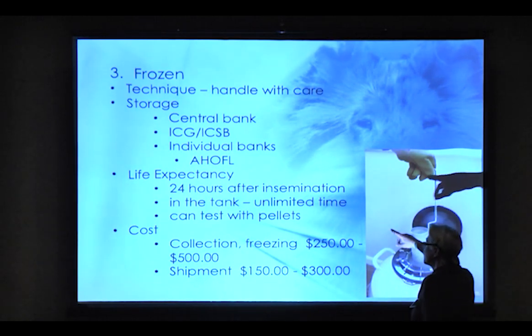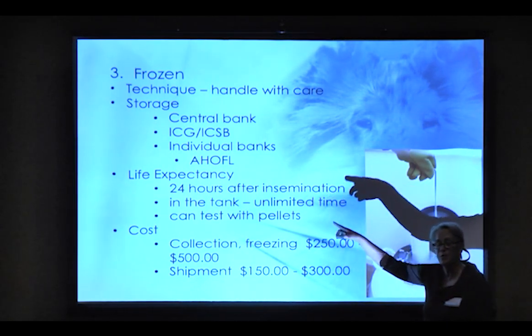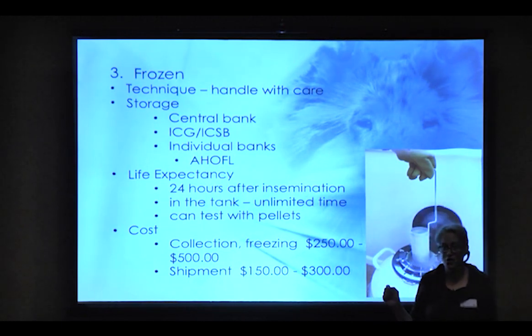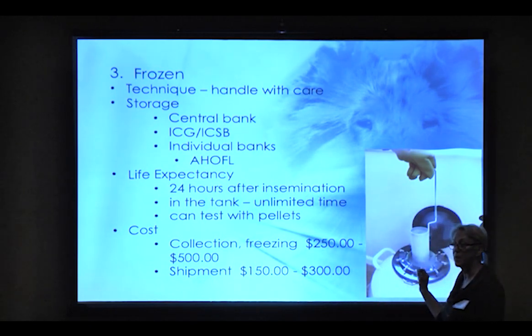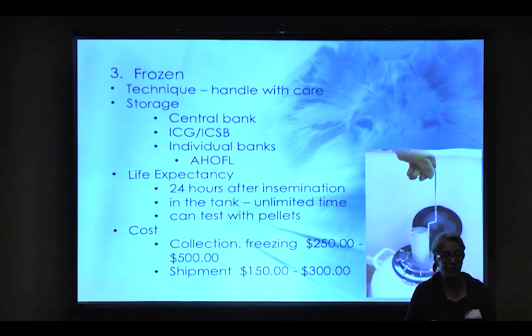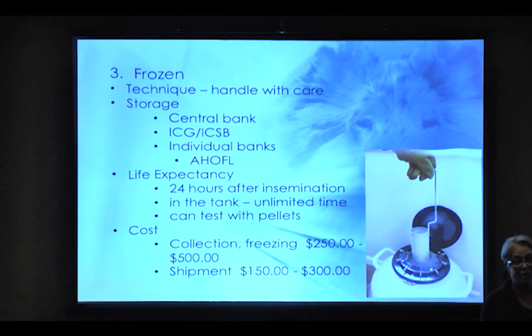We freeze with pellets. There are two different ways to freeze. The reason we freeze with pellets is that you can take one pellet out and test it before you ship, to make sure that pellet is healthy. That way we can actually certify the pellets we are shipping to the next station. If you do it in straws, you have to use an entire straw, and two entire straws may be an insemination, whereas 10 pellets may be an insemination. Even though I know how to do both, I prefer pellets because they work better for me.